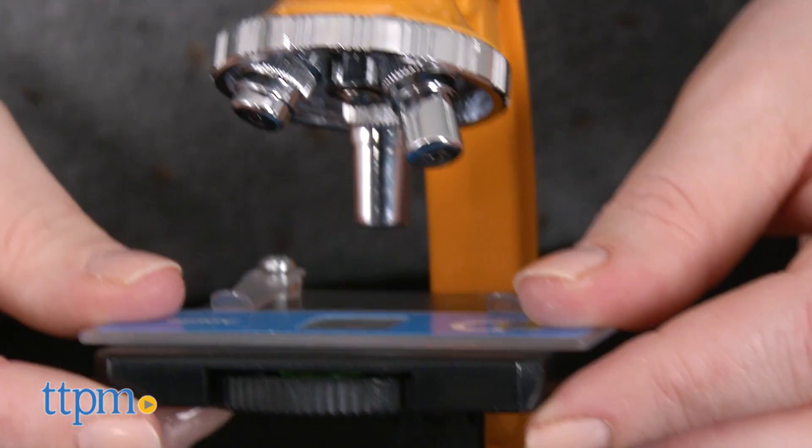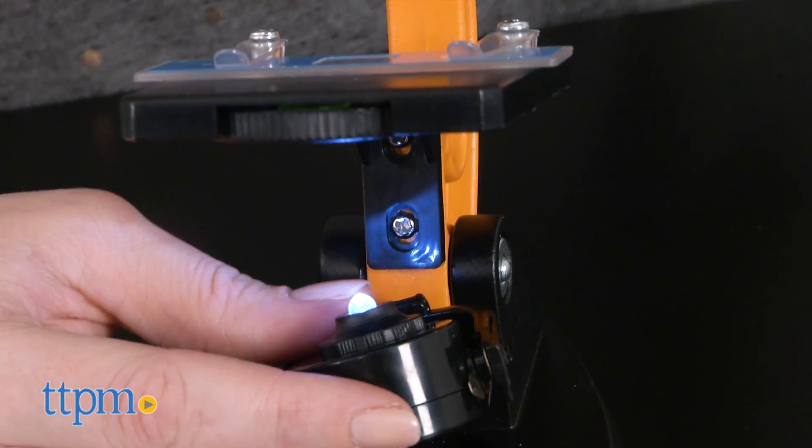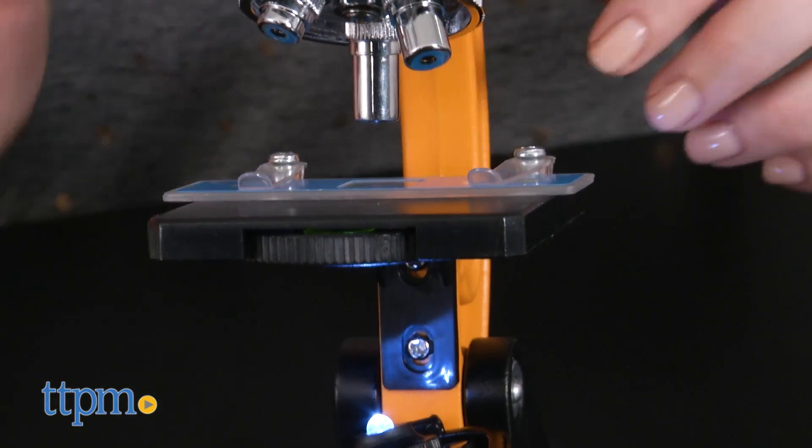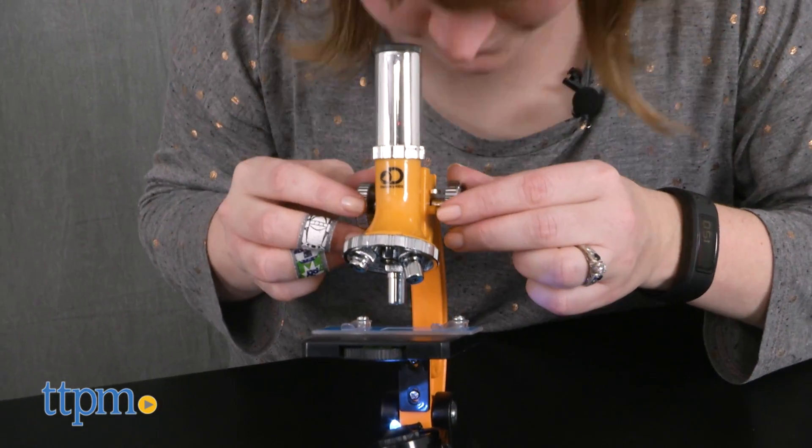This is a really nice first microscope kit for kids that helps them become familiar with how to use microscopes. The microscope itself is lightweight, so kids can easily take it with them when out in the field, and it's battery powered, so it will work wherever kids go — no outlet needed.